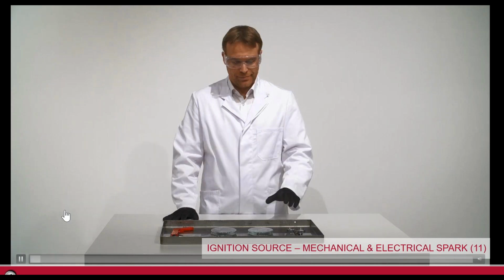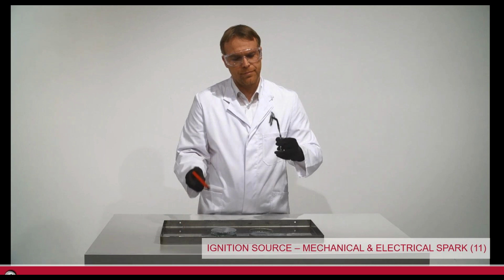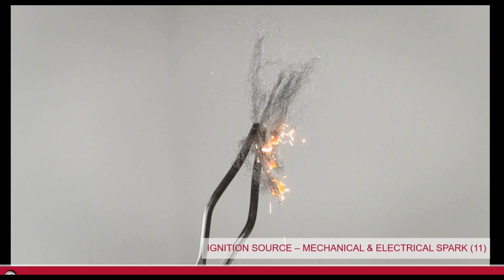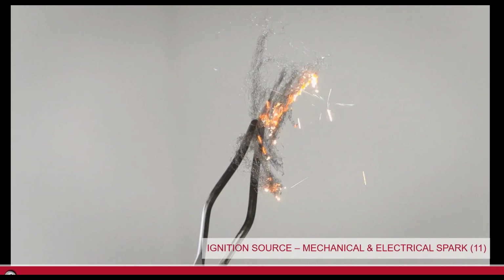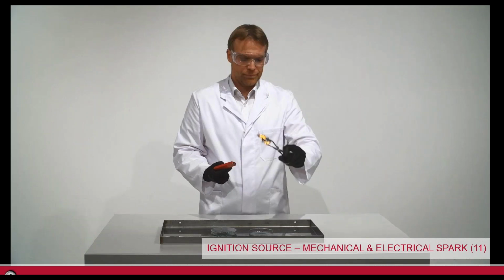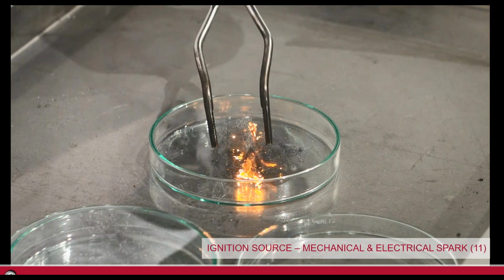Right, just a little flint-driven flame starter here. Dominic will create and start a fire with steel wool, and just a simple spark, right? So there's our mechanical spark. That could be anything in our chemistry and really the physics and different things like that. How do we mitigate and keep those components apart?